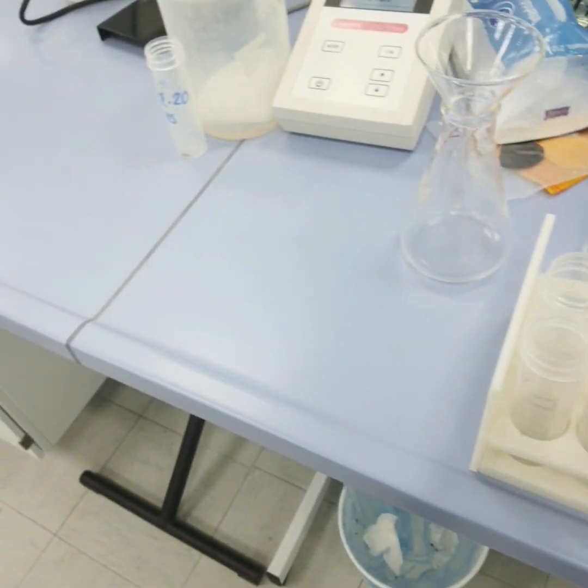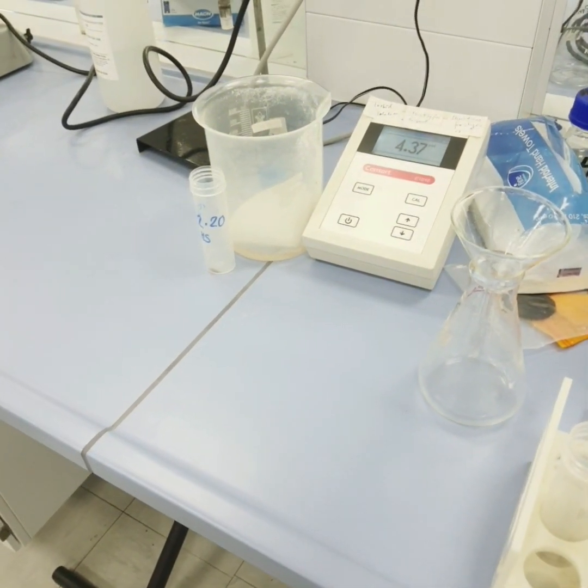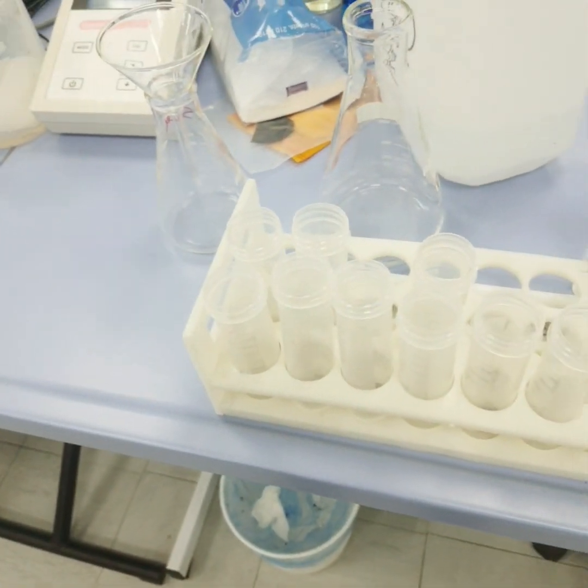Now we will transfer around 30 ml in all the vials. Okay, so let us transfer.